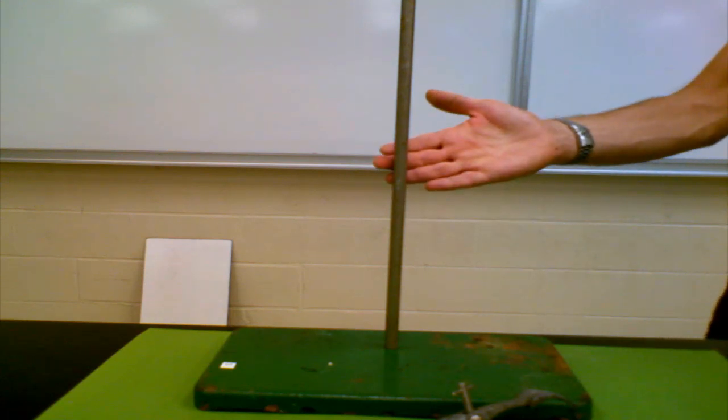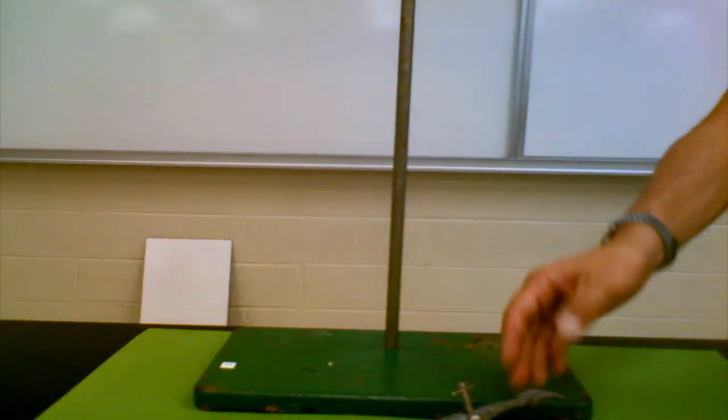In order to place a test tube correctly on a retort stand you need three things. You need your retort stand, you need your clamp, and you need a test tube.